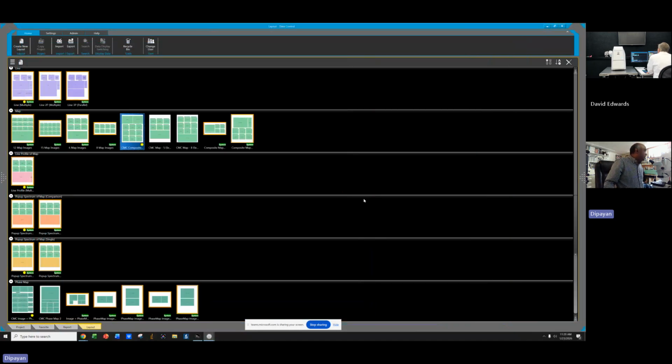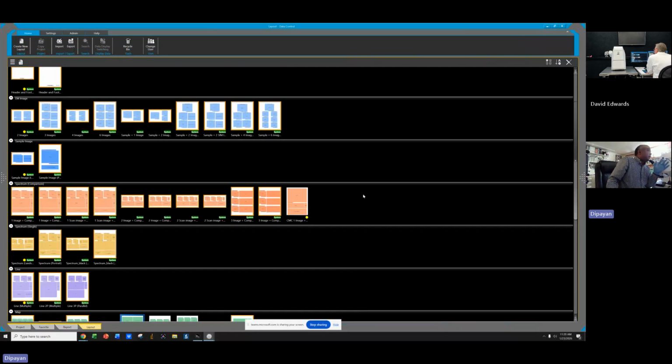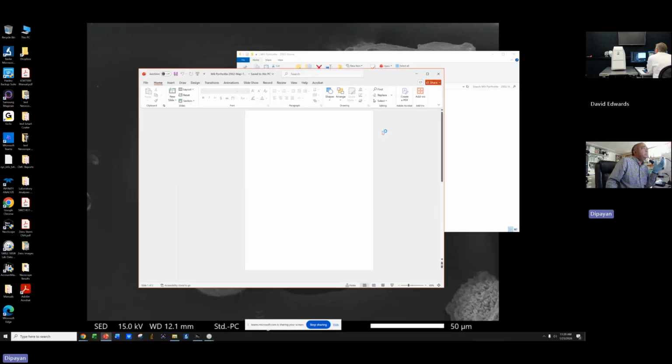The only thing you showed me separately to remember was the individual point. I don't think I ever have to do an individual point as one report, because most of my reports are going, I can pick up any one, like this one, for example, that I did.